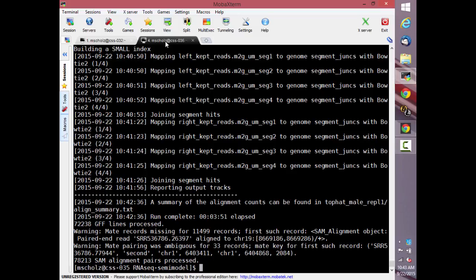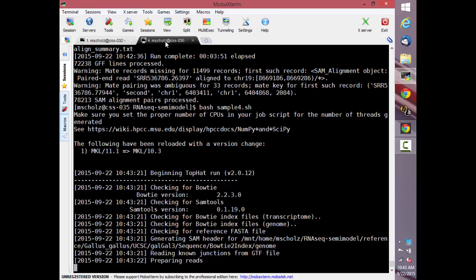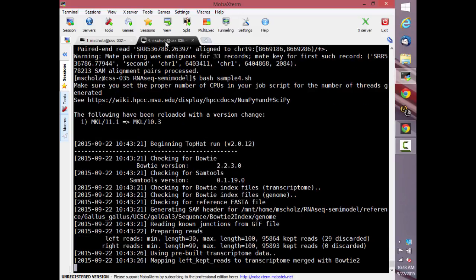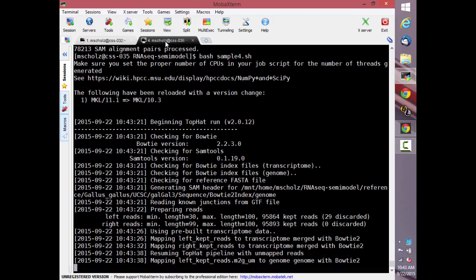The problem, and this was mentioned earlier when we were talking about what the annotation transfer did, or what the cuffmerge did, is that it's going to use the gene names from the merged GTF, which have no real meaning, right? They are, in fact, not real genes yet. Those are the Cufflinks-created gene names. So the last thing that you'd have to do before you can get any useful information out of this is get the annotations from the genes that were real, or that were originally in the Gallus gallus reference genome.